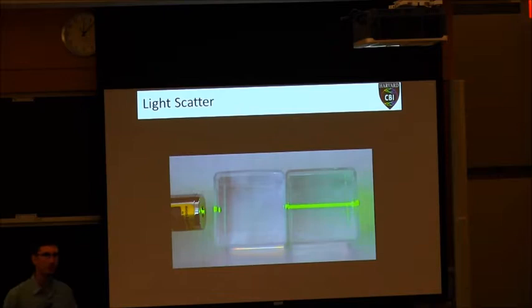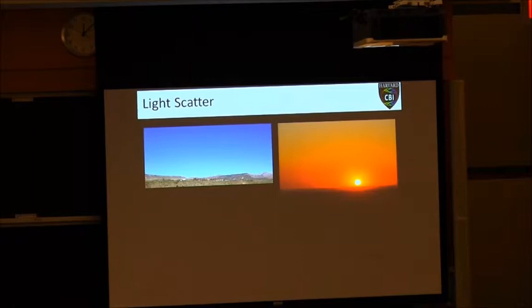And so this is what happens when we start shining a laser into our sample under a microscope. Instead of that laser passing nicely through the whole tissue and illuminating everything, we start to have what we've always called light scatter, the scattering of that light. And the same thing happens with your fluorescence coming back in. So this creates a limit on how deep we can image into something.